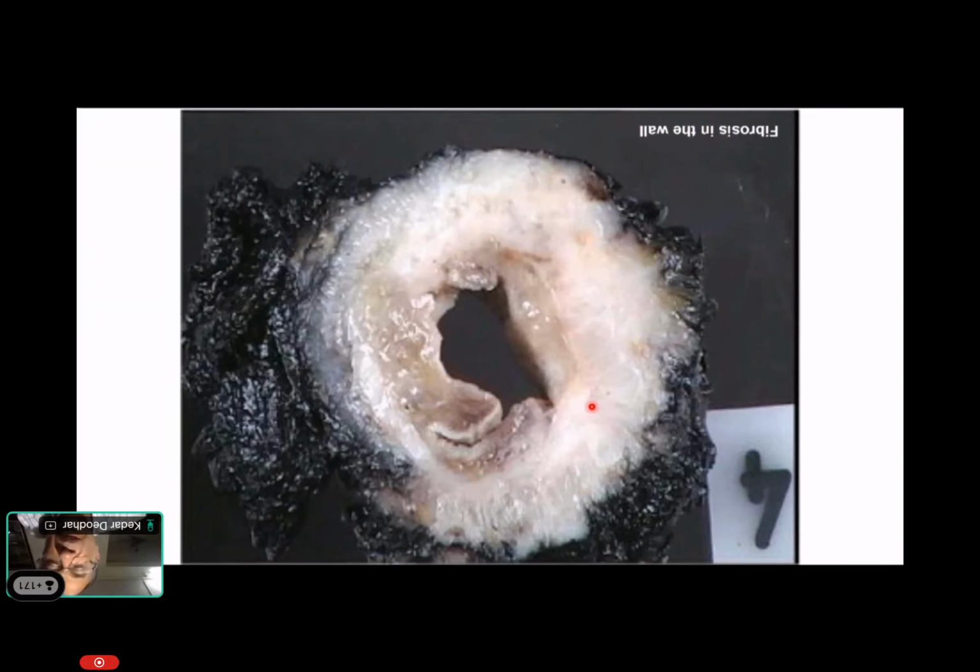Anything which looks like a fleshy area, that is where we look to section much more. To be honest, if we have a tumor, even one optimum section is enough for us to give proper staging. But if we don't have tumor, that's when we require more sections, 4, 5, 6 sections. We need to examine deep cuts to give the proper tumor regression grading score.